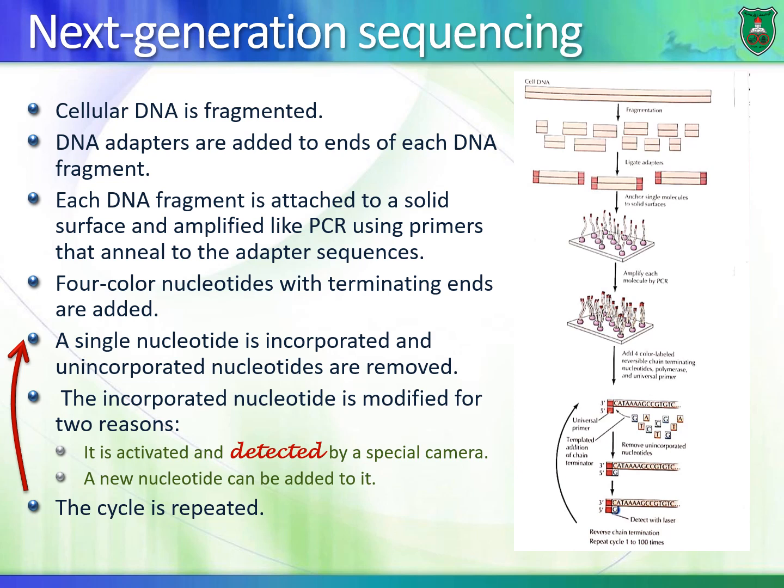And this is how it's done. It's all computerized, it's all automated, and it's really genius. And since we have, by the way, the Human Genome Project completed, we can always refer to that database. So what we do is the following. We take a whole DNA from a cell, the whole genome, and we cut it into different random fragments. I don't care about restriction endonuclease cutting at a certain position. No, no, no, it's just random fragmentation of DNA.